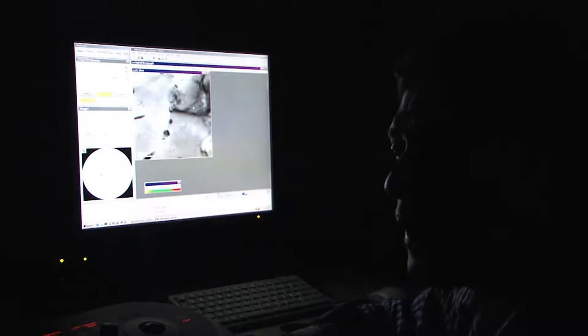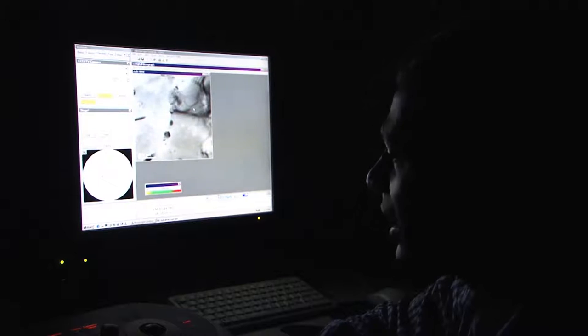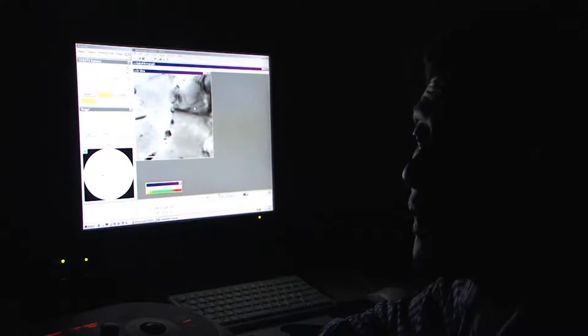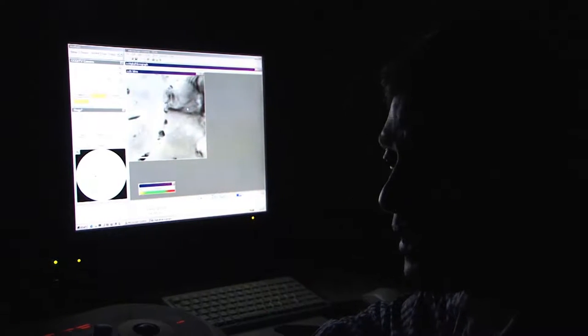By using the diffraction pattern, subsequently one can generate either a bright field image or a dark field image, or even use it for high resolution electron microscopy. So this is a very powerful process, so that one can analyze almost all features present in the sample at the fine scale, to the level of Angstrom or sub-Angstrom nowadays. One can gather information. That is the reason I have told you in the last lecture or this lecture that the transmission electron microscope is basically a versatile equipment, which can be used for many kinds of analysis of the sample.